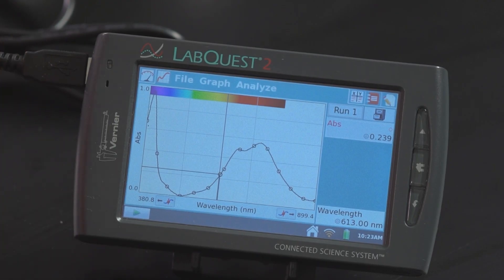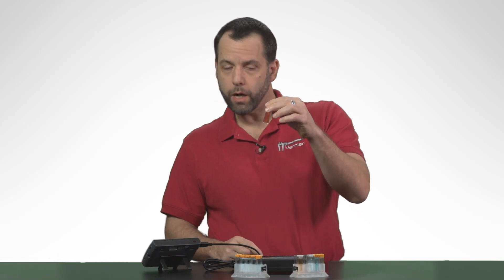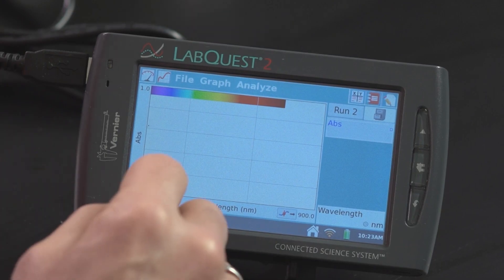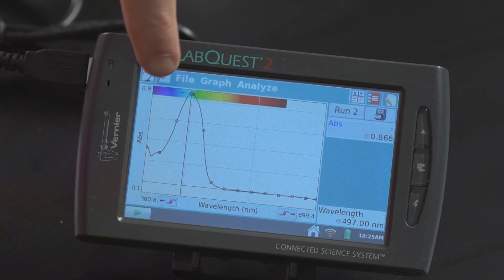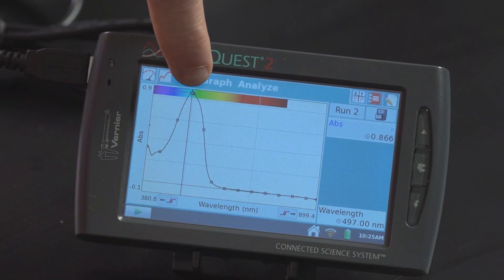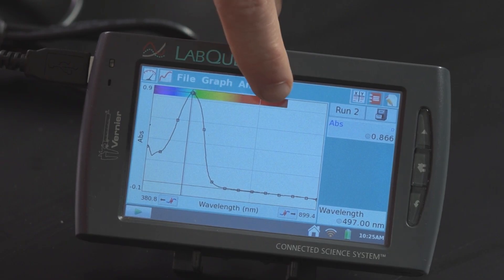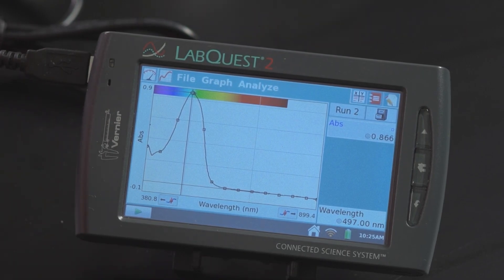If I wanted to store this run, I could just hit this little store button right here, and then I could look at red food coloring. Now red food coloring is probably going to absorb mostly in the green. So if you look here at this absorbance peak from red food coloring, you can see that it absorbs a little bit in the blue, and then it increases as we get into the green, and then it begins to decrease across the green, but there's very little absorbance here in the red. That means all of these wavelengths are allowed to pass through the solution — that's why the solution is actually red.